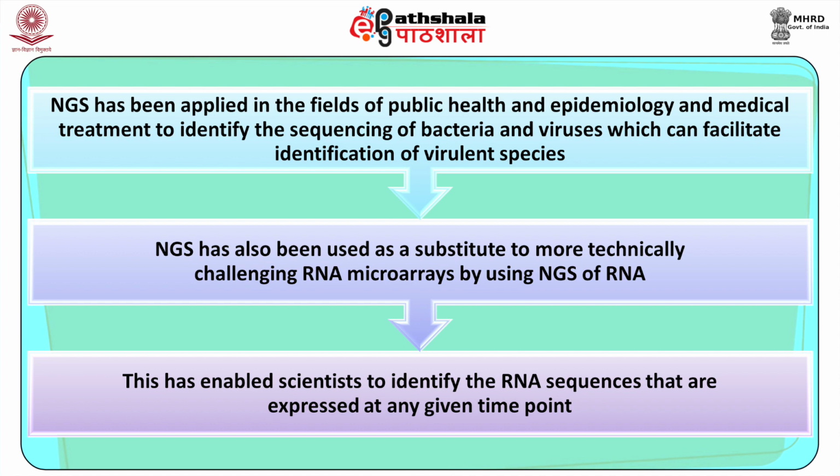Next generation sequencing has been applied in the fields of public health, epidemiology and medical treatment to identify the sequencing of bacteria and viruses, which can facilitate identification of virulent species.